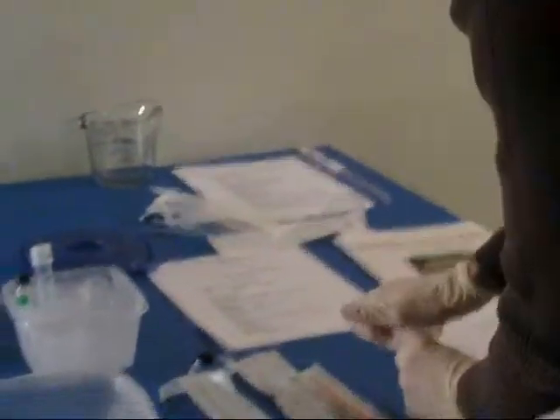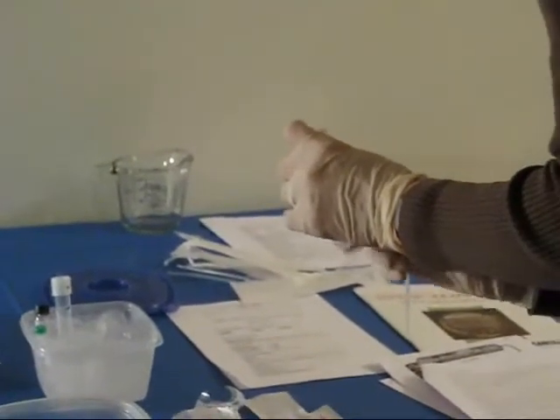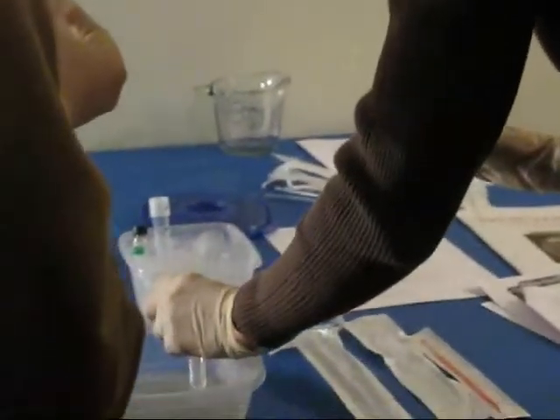I'm going to close this down and put it at room temperature for a five to fifteen minute recovery. I'm just going to set it in here.